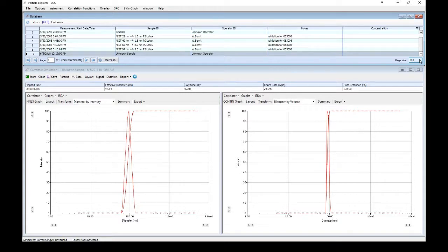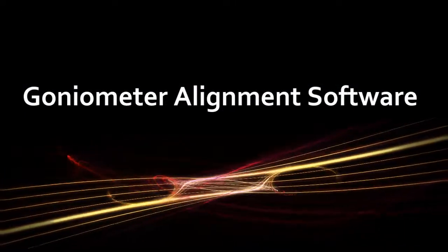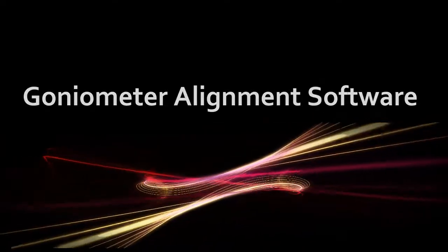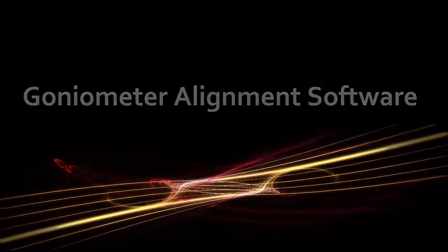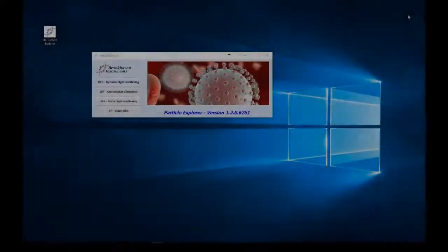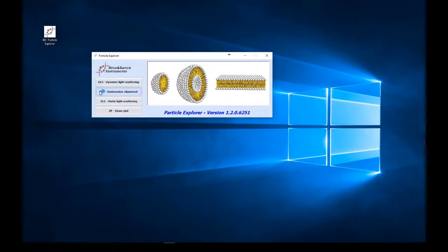That was an overview of the DLS software capabilities. Let's take a look at another measurement type. To perform any light scattering measurement, especially a static light scattering measurement, the goniometer must be in good alignment. An alignment is typically performed by a Brookhaven technician or an experienced user. To check that your instrument is still in good alignment, use the IST goniometer alignment software.